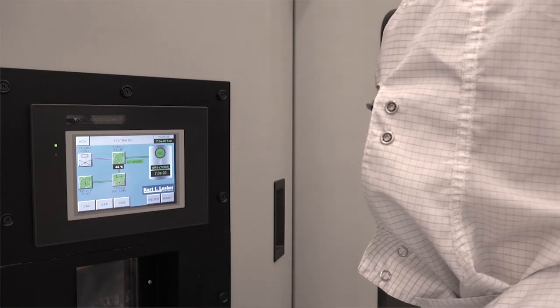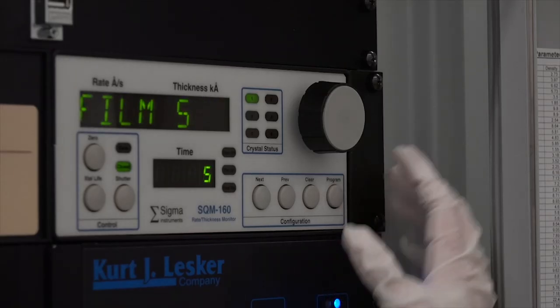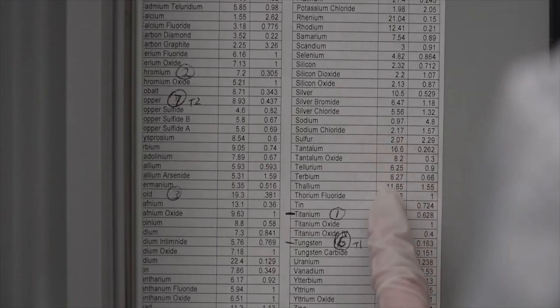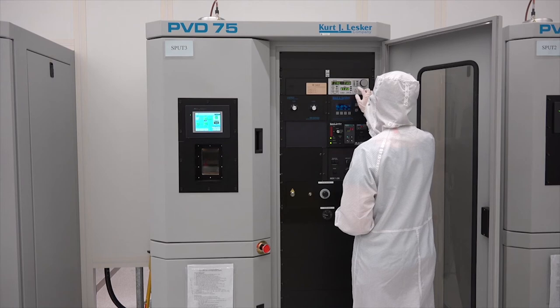Okay, the turbo pump speed and chamber pressure have stabilized. We are nearly ready to begin deposition. First, let's set up the thickness monitor for the desired material. In this case, we will deposit titanium. The thickness monitor will display the deposited thickness in real time. We are now ready to turn on the plasma, which is also called striking the plasma.